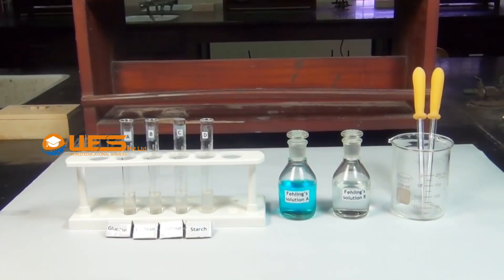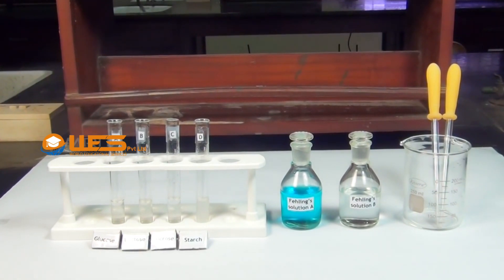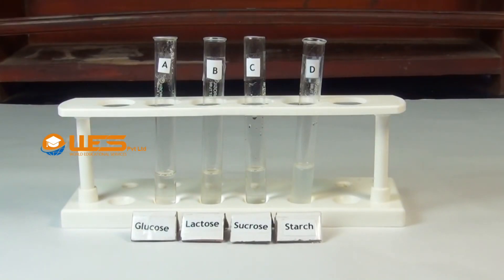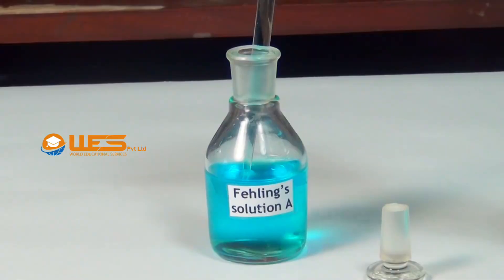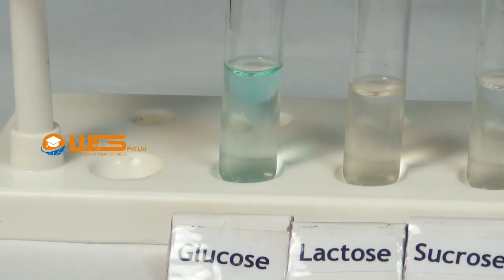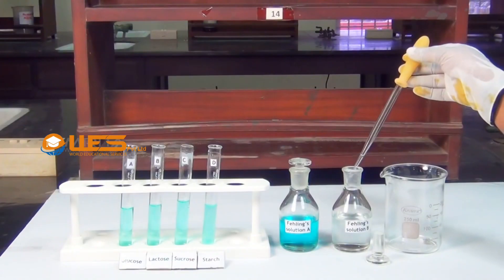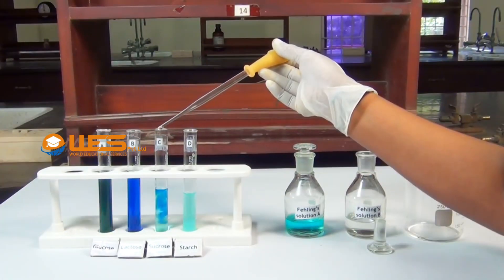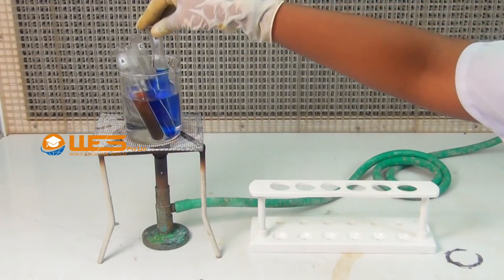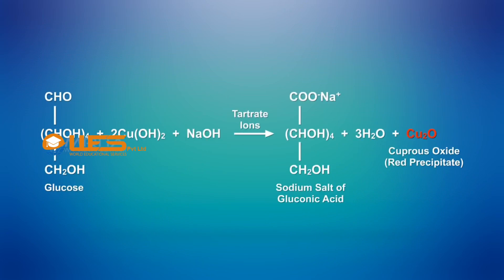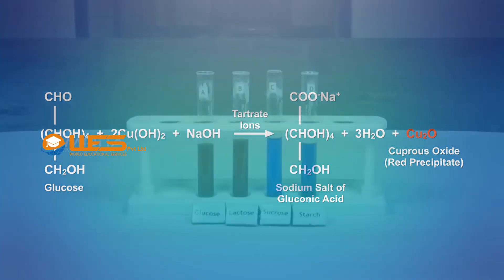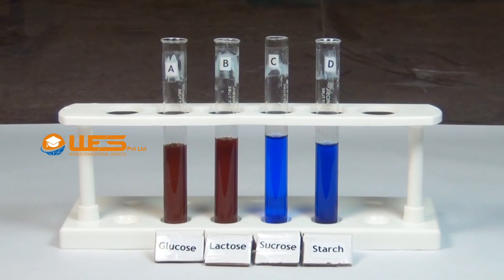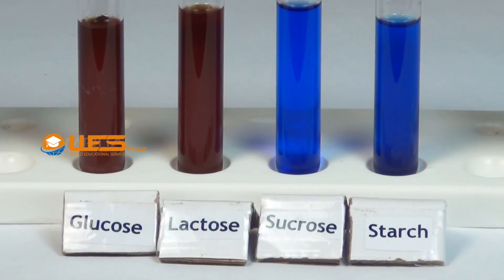Fehling's Test. Take a small quantity of aqueous solution of glucose, lactose, sucrose and suspension of starch in four test tubes A, B, C and D respectively. Using a dropper, add a small quantity of Fehling's solution A into each test tube, then add a small quantity of Fehling's solution B. Heat the test tubes in a boiling water bath for some time. The reducing sugars, glucose and lactose, reduce the copper ions in the reagent to form a red precipitate of cuprous oxide, whereas no such precipitate is formed from the non-reducing sugars, sucrose and starch.